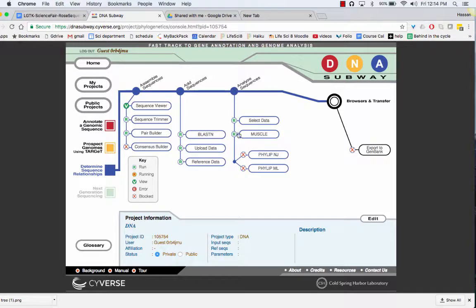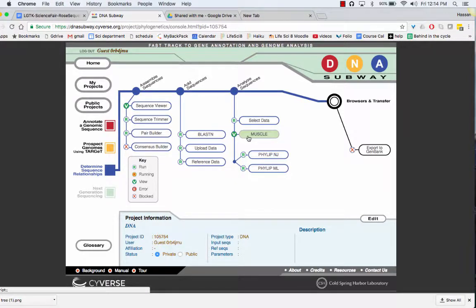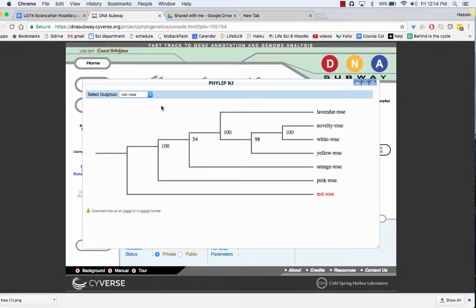Then you're going to go to muscle. That's going to align all of the sequences. And then you click here to create the cladogram. Click again. And here is your nice cladogram.